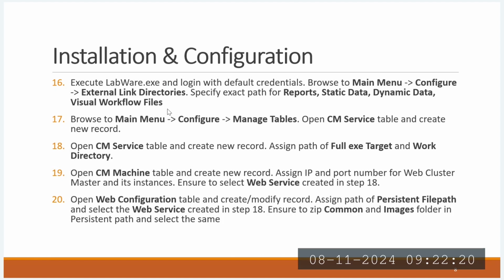Static data is what I prepare as part of my regular tasks, wherever version controls are available. Dynamic data is things like menu routines, subroutines, and format calculations, wherever you don't have version controls; that is part of your configuration and is called dynamic data.